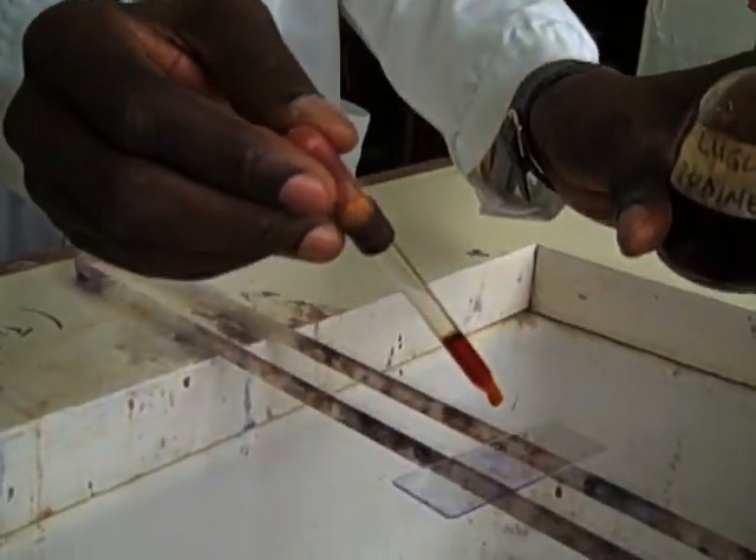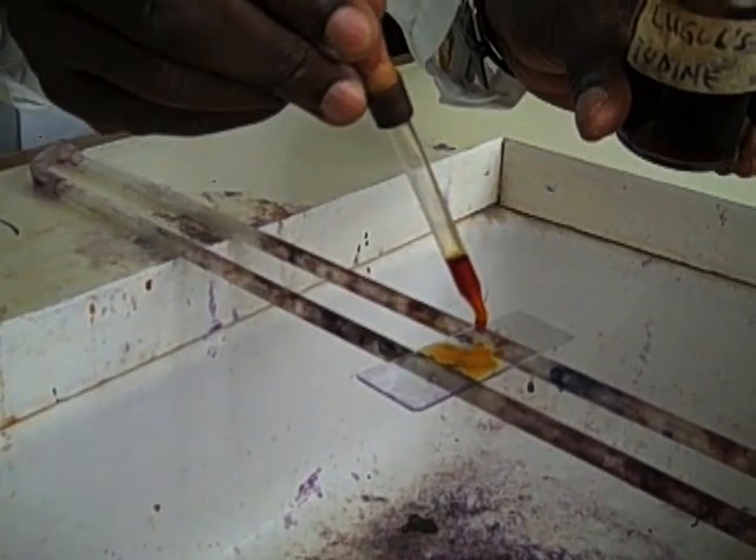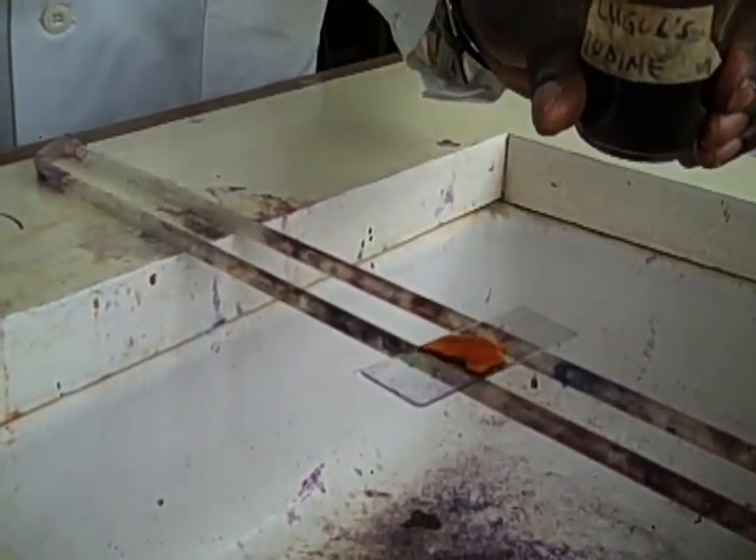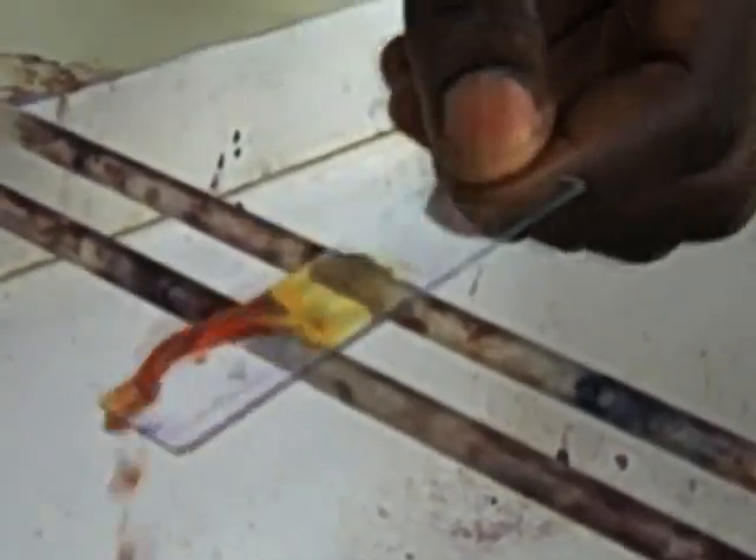Tip off the water and cover the smear with Lugol's iodine for one minute. Then wash off the excess Lugol's iodine with gentle tap water.